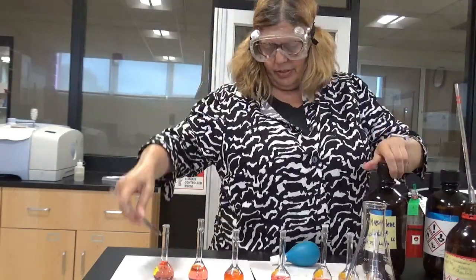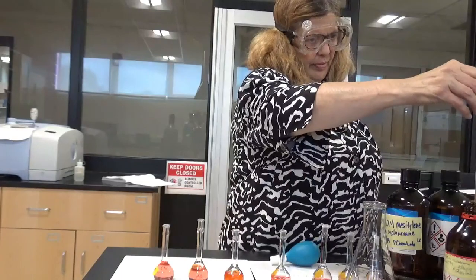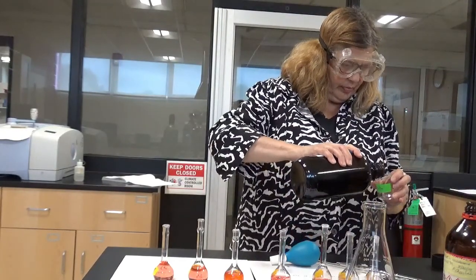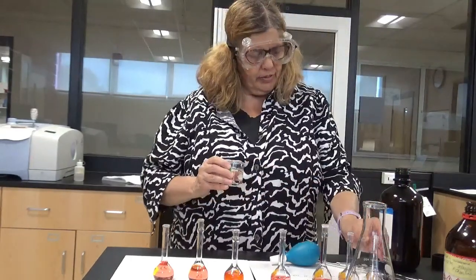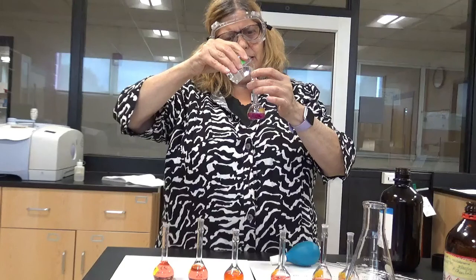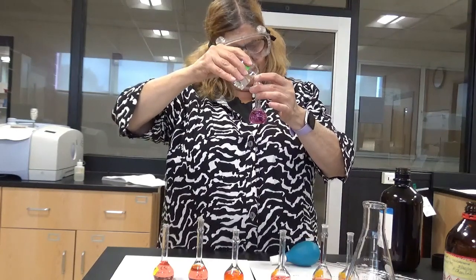Close up these solutions. All right, what I'll do is I'll pour it so it's close to the mark, and then I will use a pipette to finish it off. And the mark is different on every one of these. This is the first one, and it has that deep purplish kind of color. The others are a little more, I don't know, they turned a little orangey.